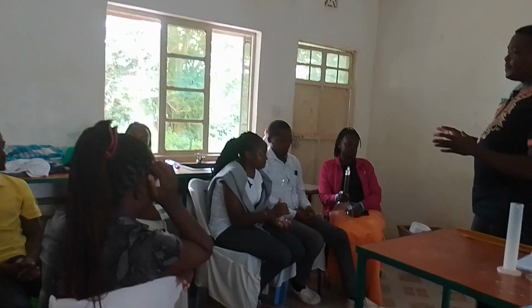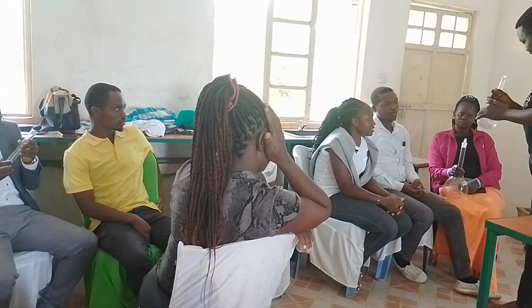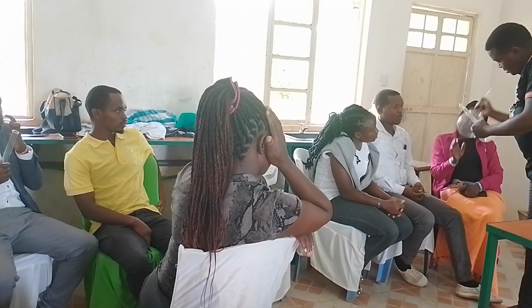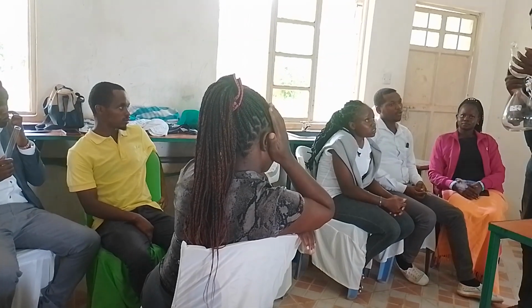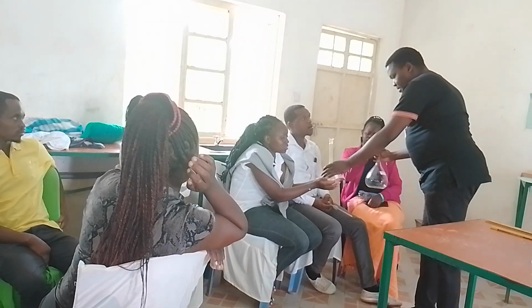That one is up. Thank you, appreciate that. This one is up. That is a pipette, appreciate him. This one is a flat. For the dimension flat, some others are round bottom. This is flat. The others are round bottom. We will see them in due course.